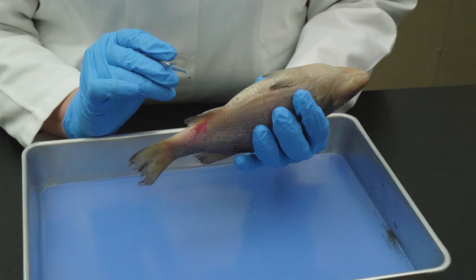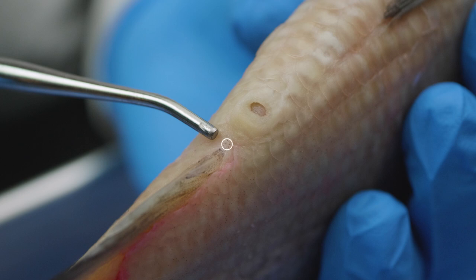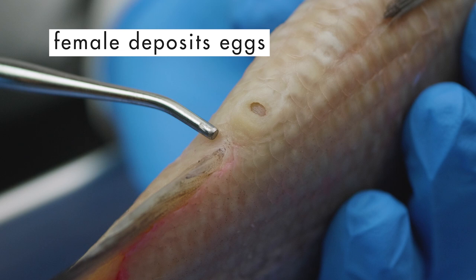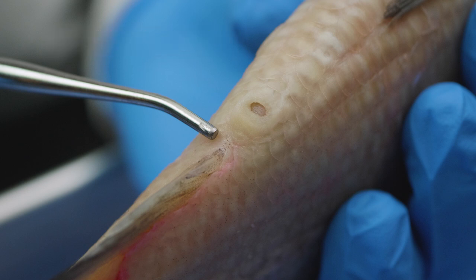On the ventral side of the perch, anterior to the anal fin, are 2 small openings. This one is the anus, where solid waste is excreted from the fish's digestive system. The other opening, which is closer to the anal fin, is the urogenital opening. A perch uses its urogenital opening to excrete liquid waste from its bladder. A female perch also deposits eggs through the urogenital opening, and a male fish deposits milt. It is often too difficult to determine the gender of a preserved specimen until we look at the internal anatomy.